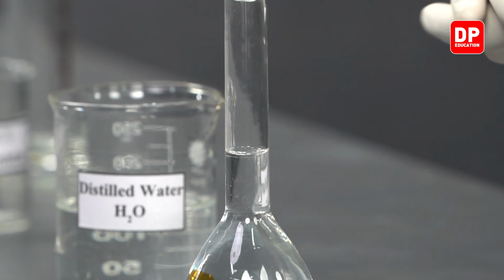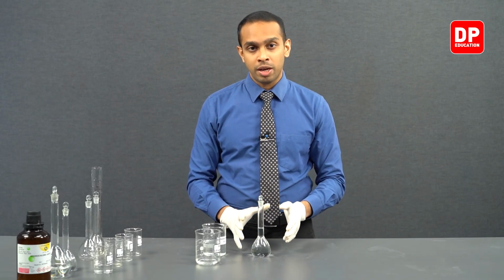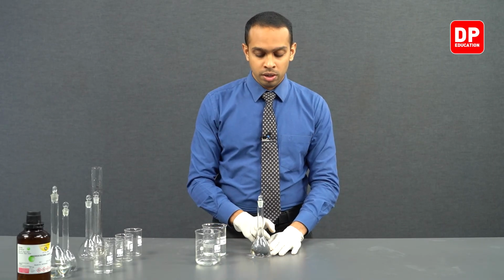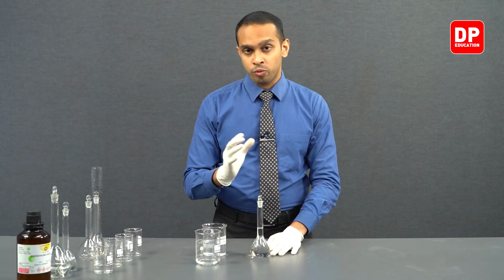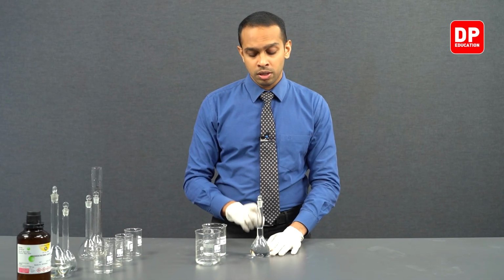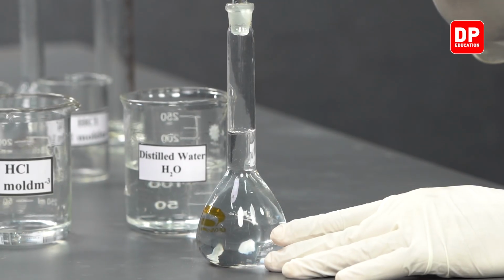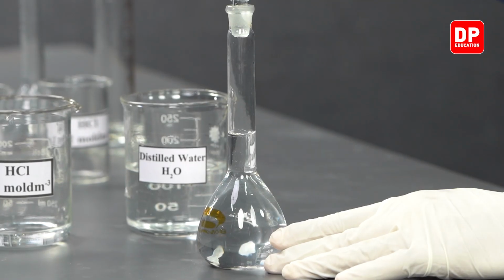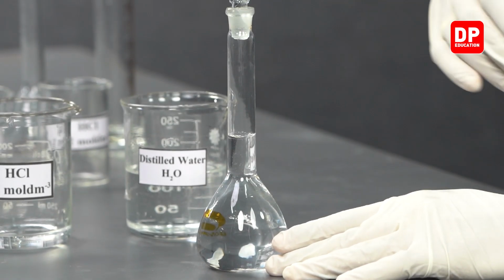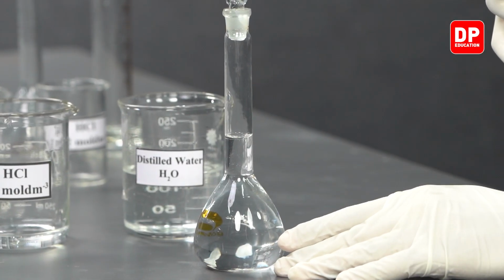Since you have seen it in the two previous instances, you can imagine that in this instance also it is perfectly aligning. So whenever you are making any solution, it is very important to make sure that the bottom of the meniscus aligns perfectly with the calibration mark. If you accidentally add a little bit more water, you will have to restart preparing this solution.